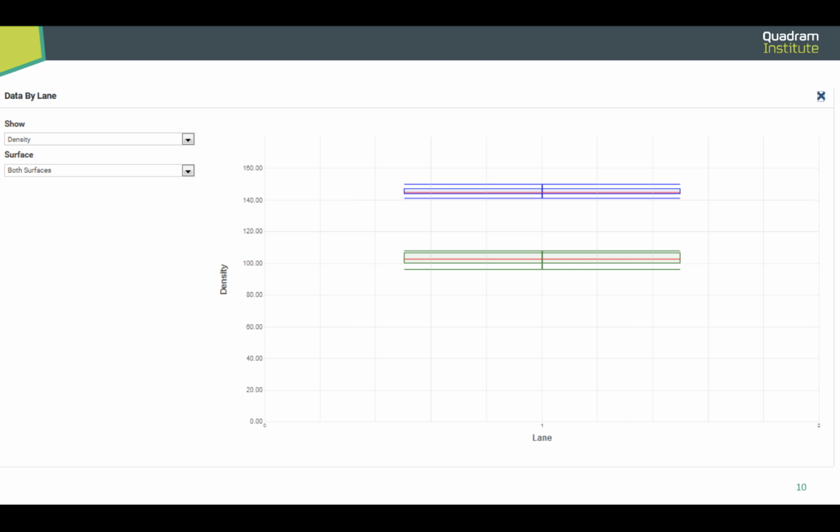And you can see that there's a fairly large gap between the blue box and the green box, showing that quite a lot of the sequences have been filtered out. And so this probably indicates that perhaps the run had slightly too many clusters, so quite a few of the dots will have been overlapping, and the machine won't have been quite so confident in how to score a lot of the nucleotides.